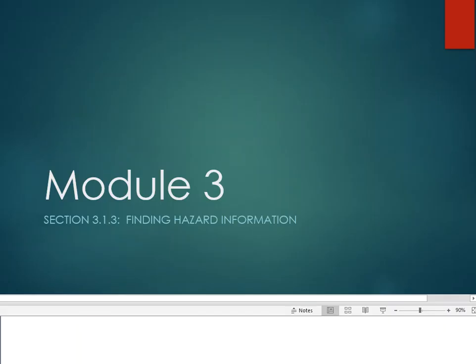Ladies and gentlemen, in this section of the module, we're going to talk about finding hazard information. So for instance, if you're working in the laboratory and you have to use a specific substance or a chemical, where on earth do you find all of this information that you need in order to handle that chemical the proper way? Well, we've kind of already discussed some of it, right?